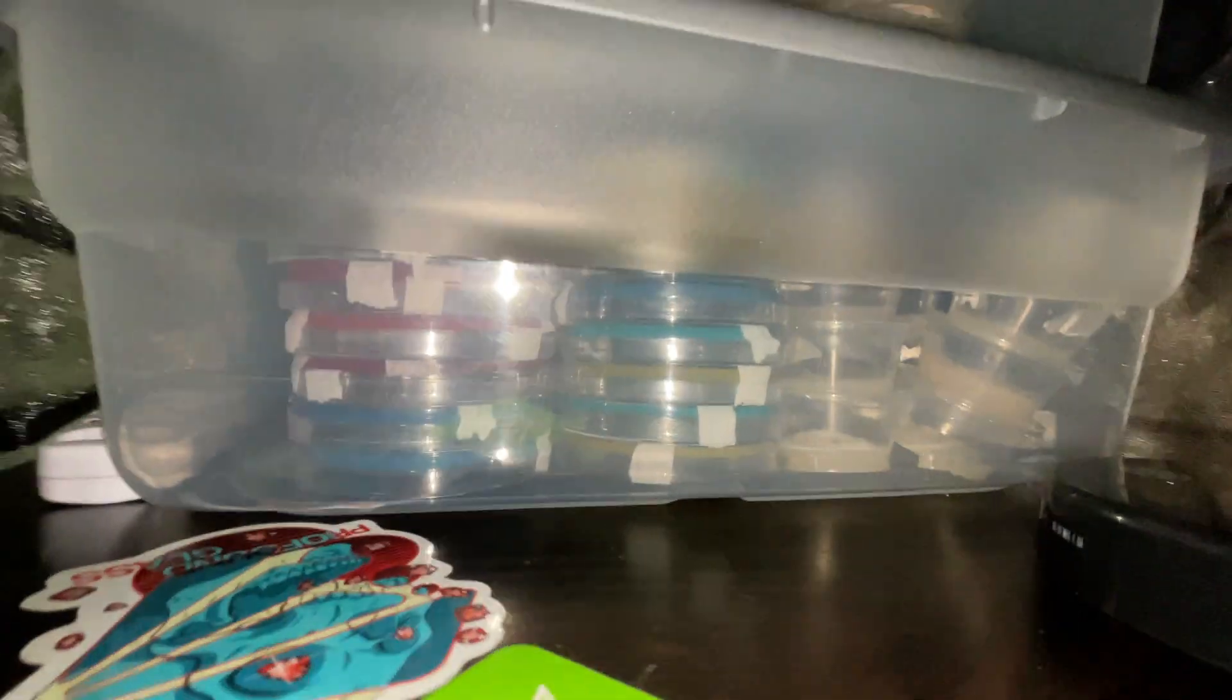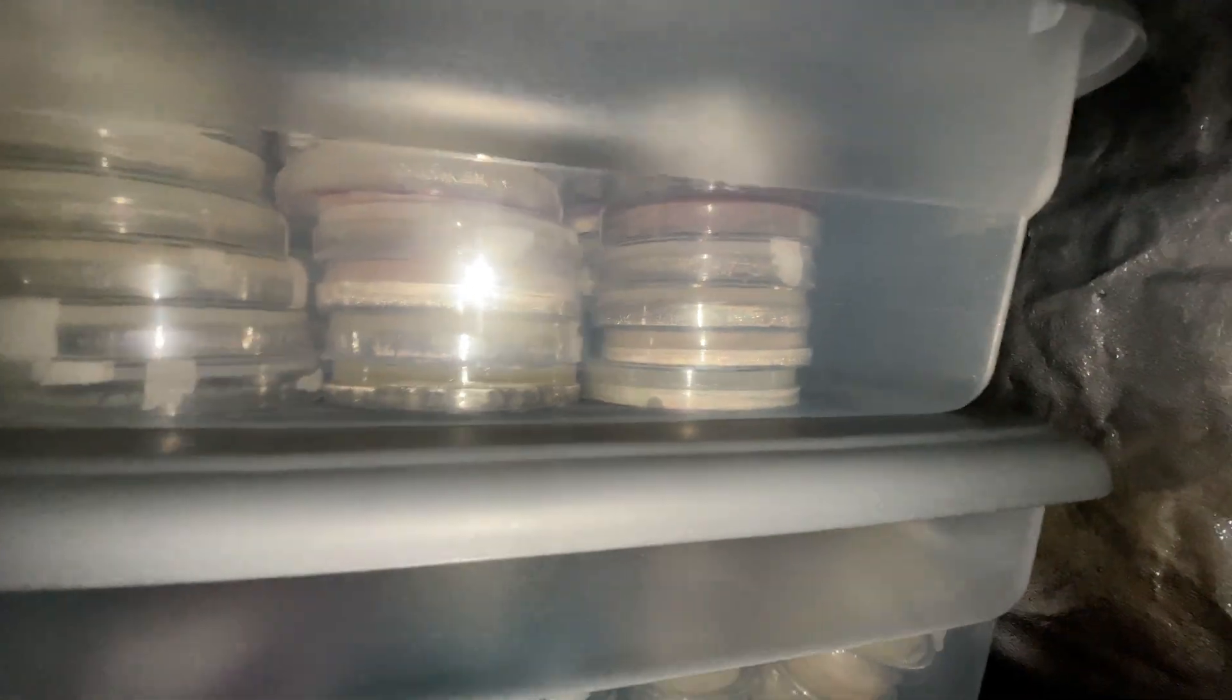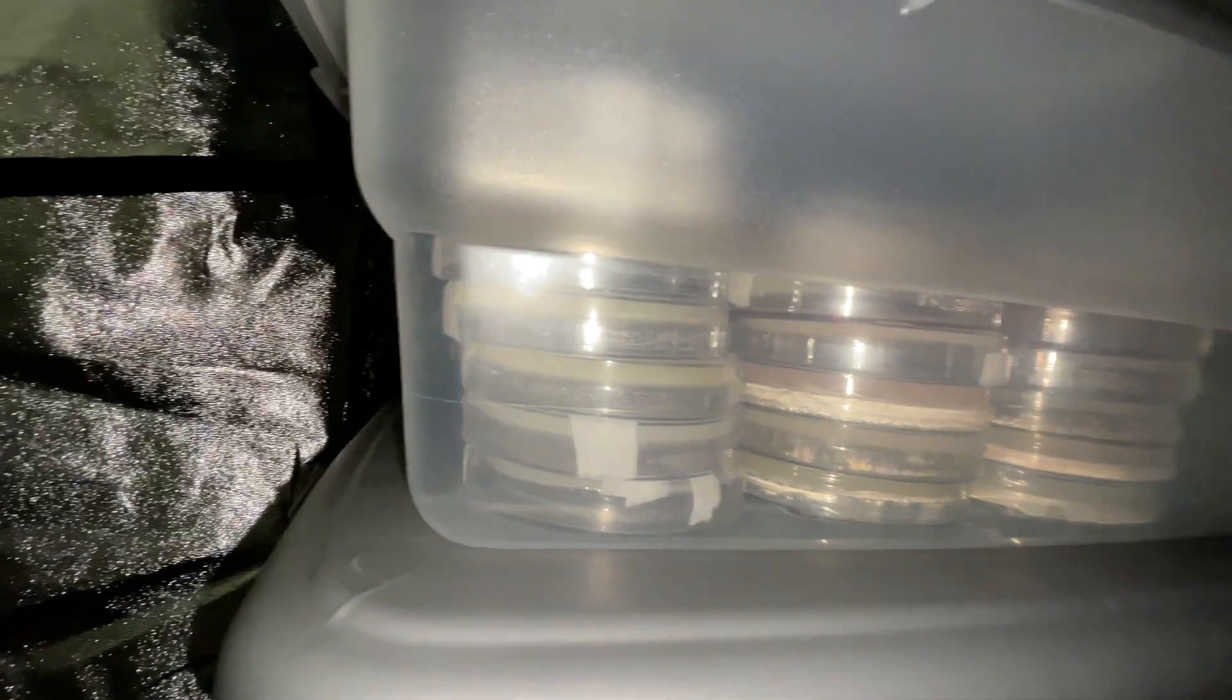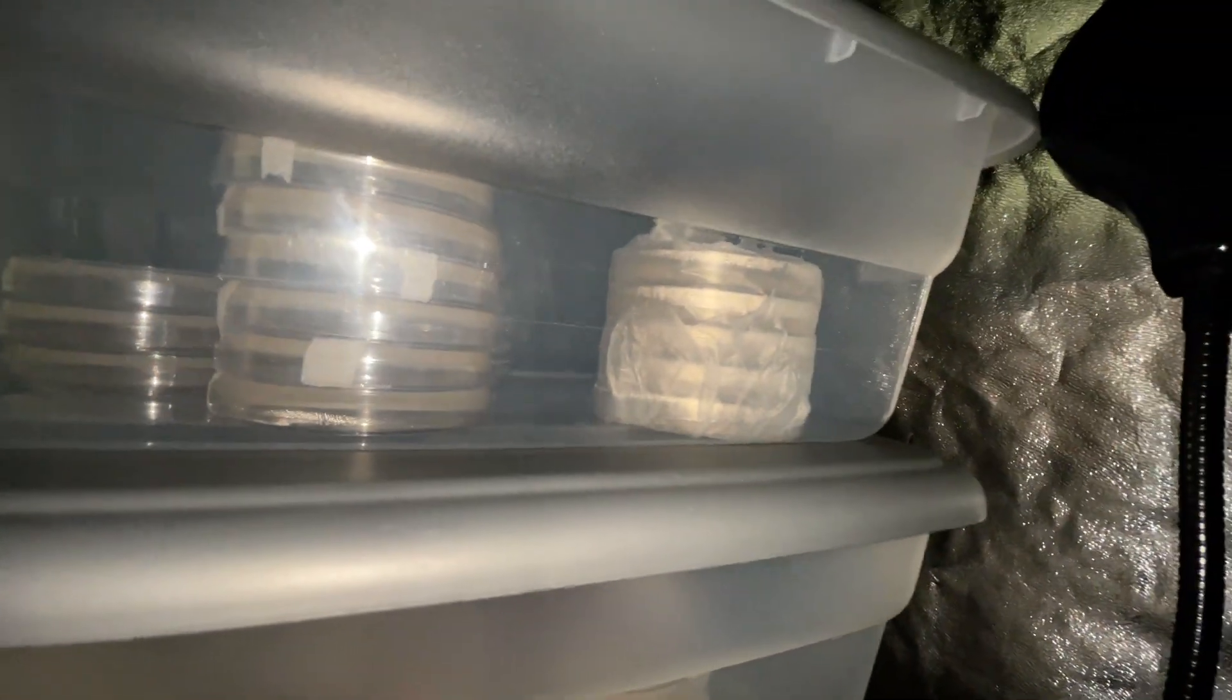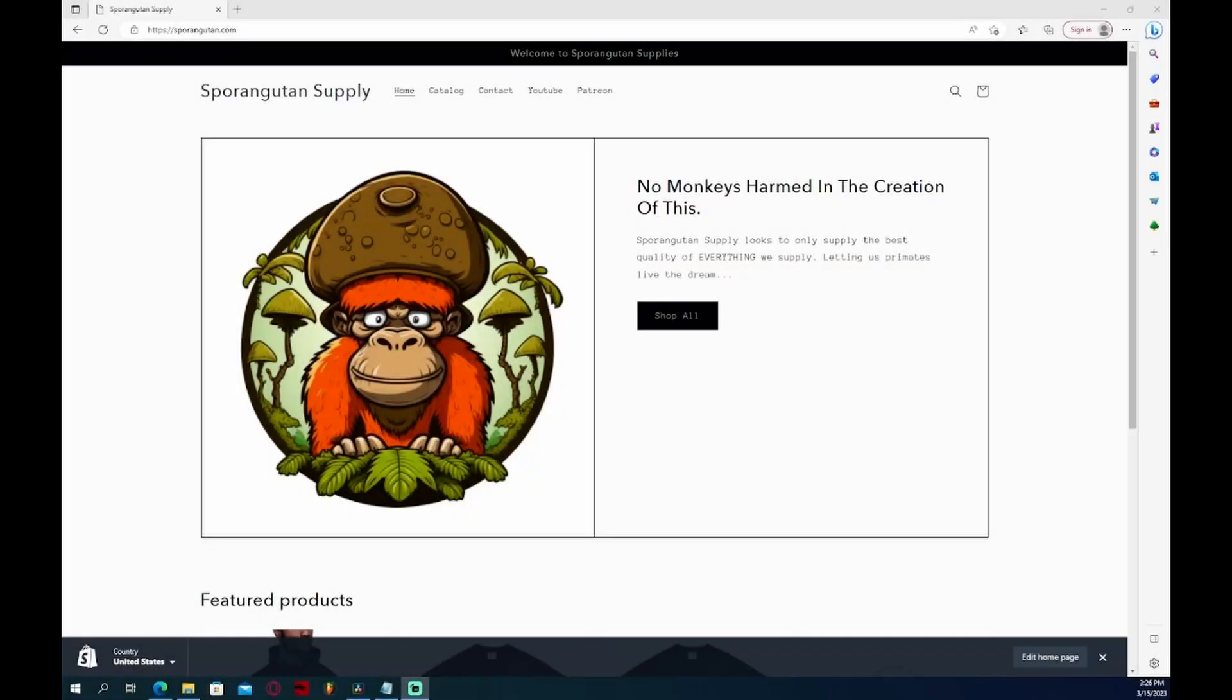Finally, this is how much agar I have going right now. If you're curious what it looks like to be ultra deep in a passion, this is mycology for you. Lots of plates.